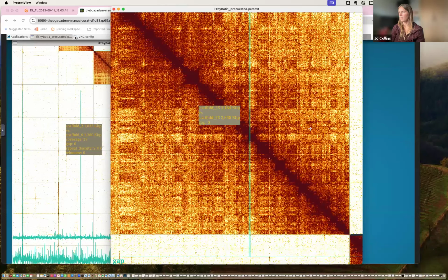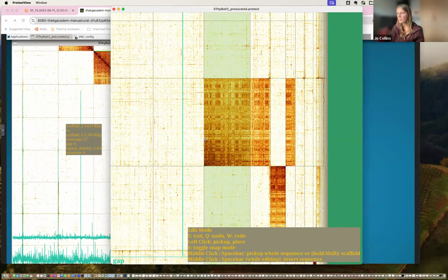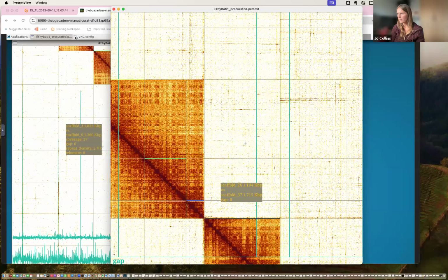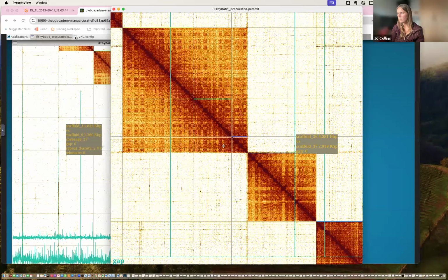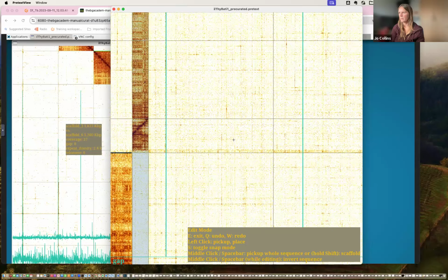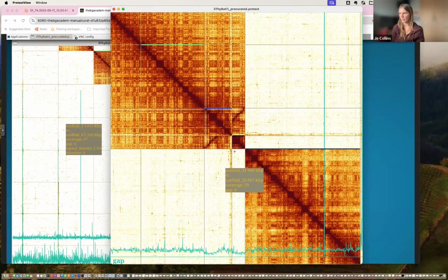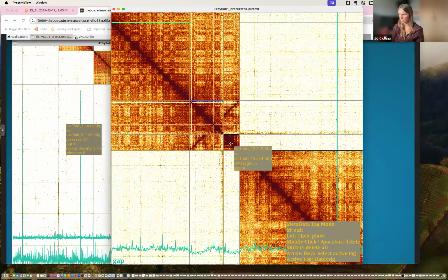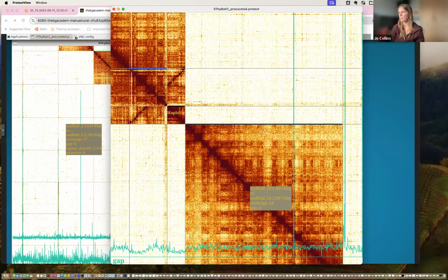Okay, we're all okay there. We've got a couple of scaffolds we can bring over together. So that one strongly matches with that. That one seems to be coming through there as well. And look, we've got another haplotig. And we can see the drop in coverage over the haplotig. So we'll use our metadata tag mode to put our haplotig tag on. We'll look through the next one.